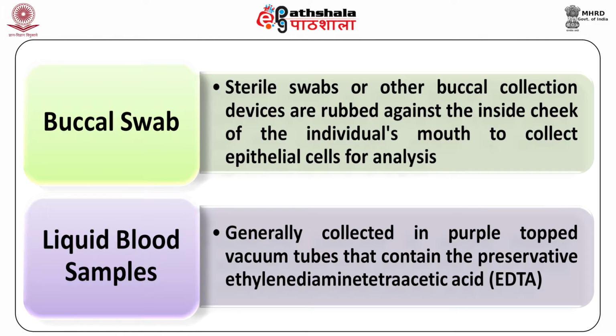For collecting a buccal swab, sterile swabs or other buccal collecting devices are rubbed against the inside cheek of the individual's mouth to collect epithelial cells for DNA analysis, and liquid blood samples are generally collected in vacuum tubes having EDTA as preservative.